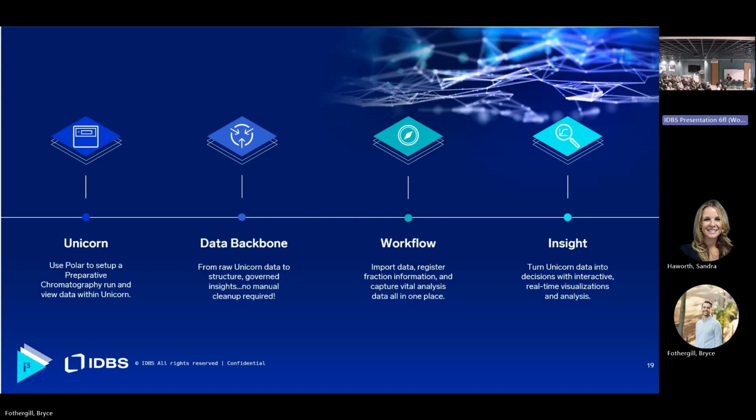A lot of the work we do is done in that try-it-and-see way, to see what sort of value we get from it. The POC was built, we put it up on YouTube, and then we see who bites. One of our big customers did bite and said, this is something we have great interest in, and we'd like to take it forward. So at that point, we gave all our code away to TetraScience, and they decided to take it forward. They now maintain what they call their IDBS connector.